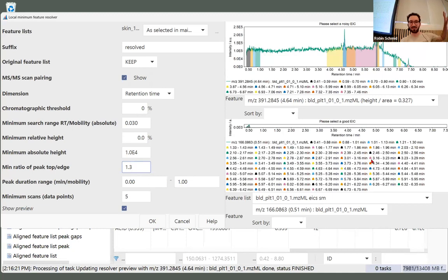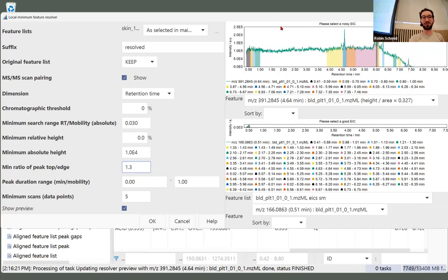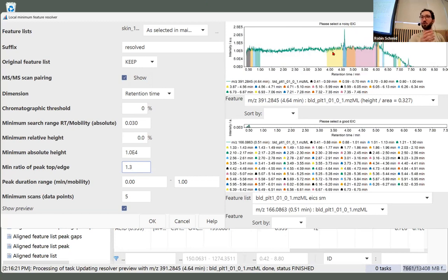You saw there's a number of little things here exploding. That was all the features that it is detecting from one chromatogram. And you can expect there to be thousands of chromatograms. And we want to split them into thousands of features, but it very much depends on the complexity of your data set. And if we have something like here on the top, I would rather discard the whole thing and not find any features than having 100 bad features that are just going to clog up my analysis, because also the processing is going to take way longer.